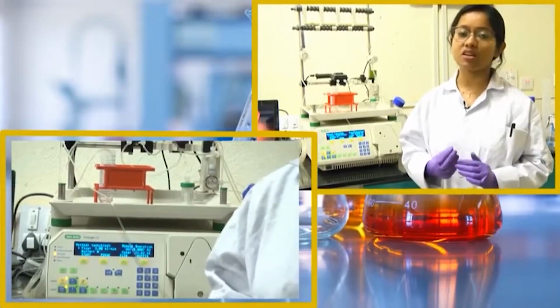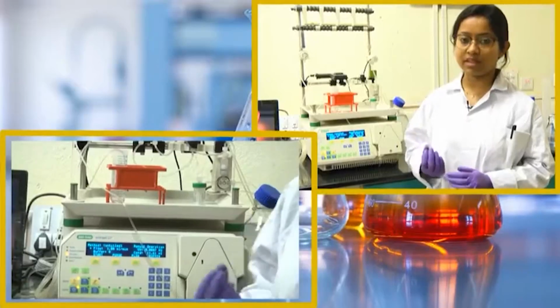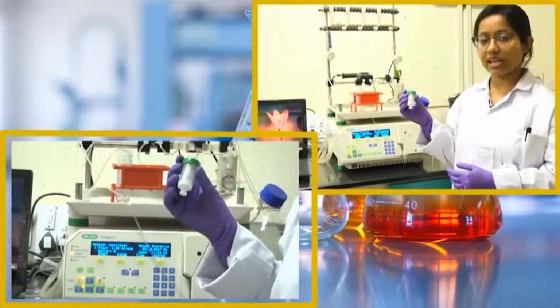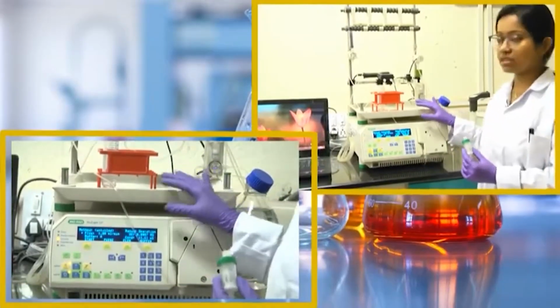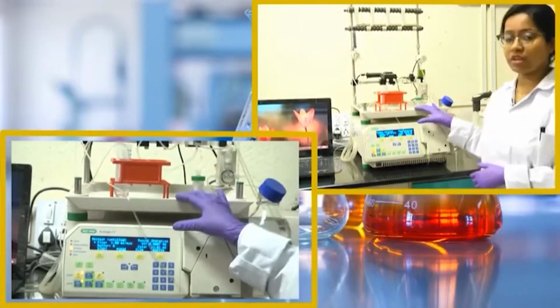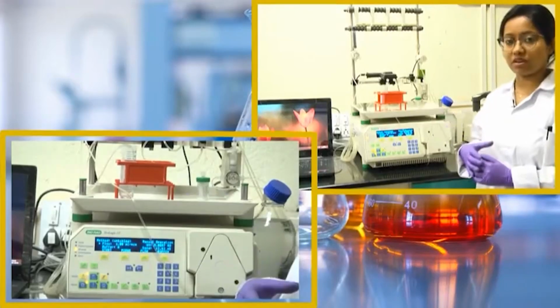This column has nickel ions attached to agarose beads, and it is packed in a small column. This is a pre-packed Ni-NTA column that we have purchased, and we will use an FPLC system, as mentioned in your chromatography lab. This is a fast performance liquid chromatography system.